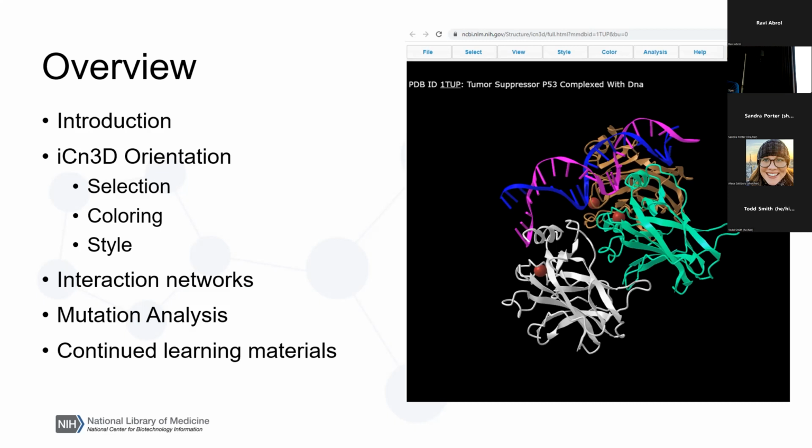The last thing I wanted to say is we don't have time to cover all things structure related, obviously. This presentation was one that I adapted from a longer workshop that was 3 or 4 hours. So I had a lot of supplemental materials that I just shifted to the back for you. This slide deck is in the presentation Slack channel, so definitely flip through that, take a look at those supplemental materials.